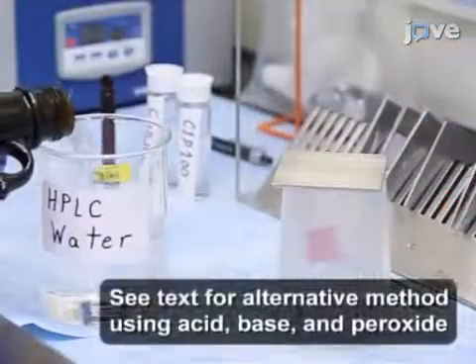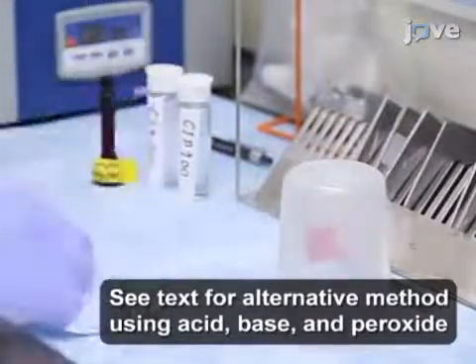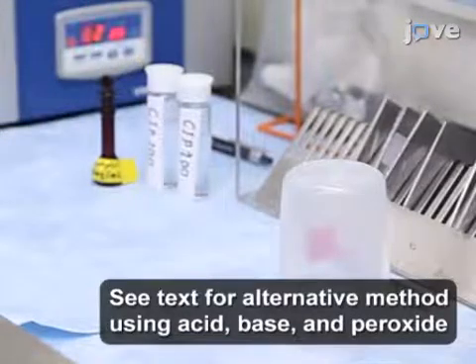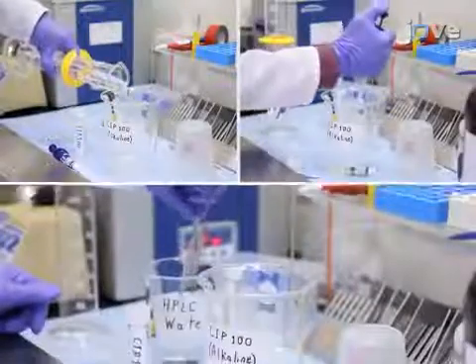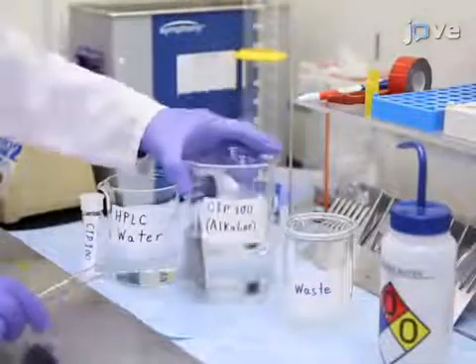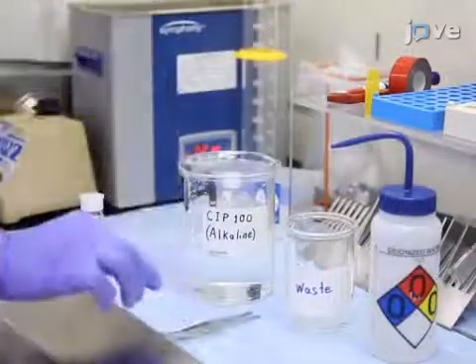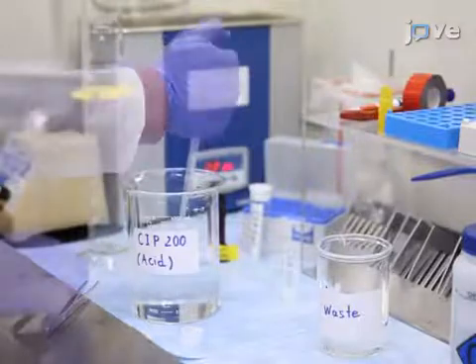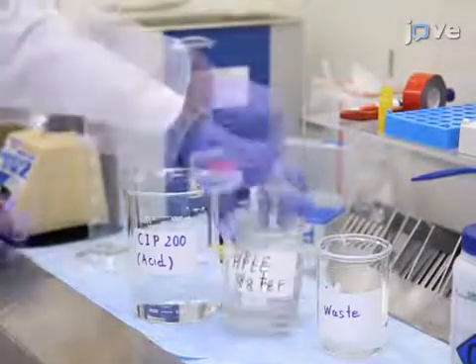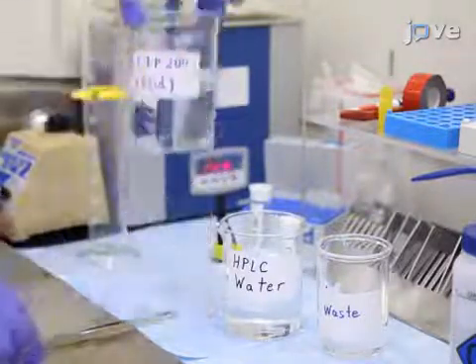To perform the advanced cleaning approach using clean-in-place solutions, immerse the coupons in HPLC-grade water and sonicate for 2 minutes. Immerse the coupons in 0.1% alkaline detergent solution in HPLC-grade water and sonicate for 2 minutes. Immerse the coupons in HPLC water again and repeat 2 minutes sonication. Then immerse them in 0.1% acid detergent solution in HPLC water and sonicate for 2 minutes. Finish with 2 minutes sonication in HPLC water.